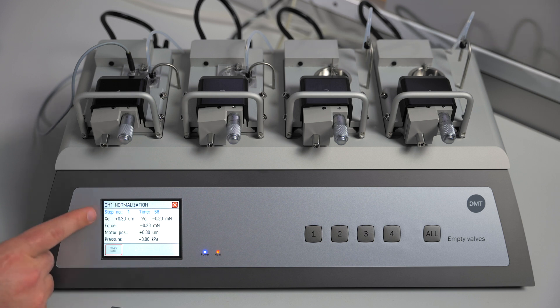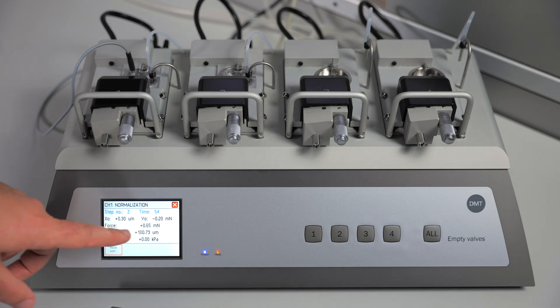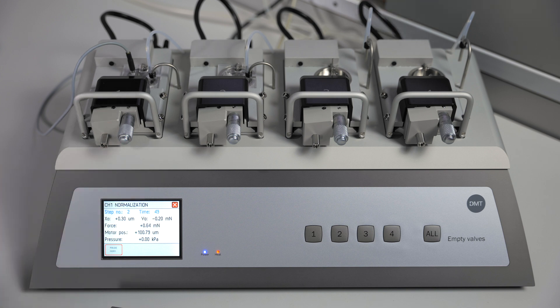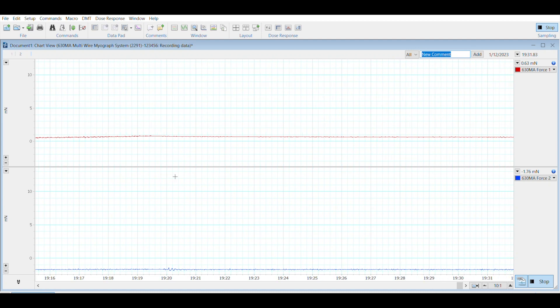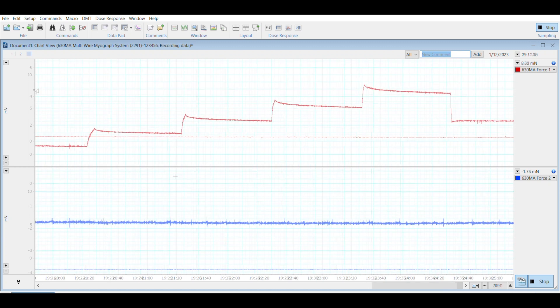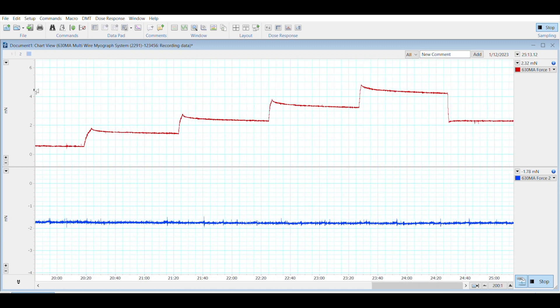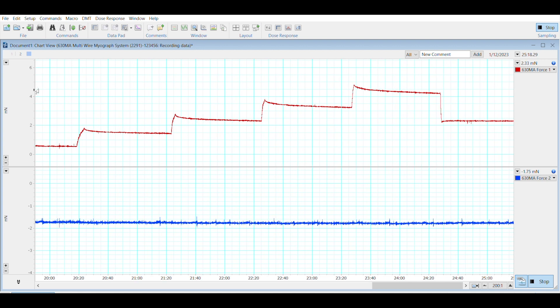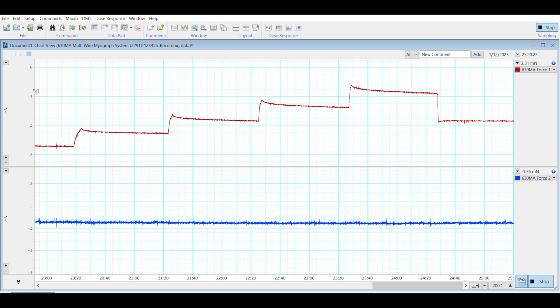It will first take a baseline reading after 60 seconds and then proceed with its next step. You will notice that the force went up by 1.0 mN, and once it hit that point it started to take a new reading. The force will drop, which is expected — that is why it will take many steps to complete the normalization. Once the force reaches the calculated target pressure line, the normalization will complete and it will automatically set your tissue to the correct normalized force.